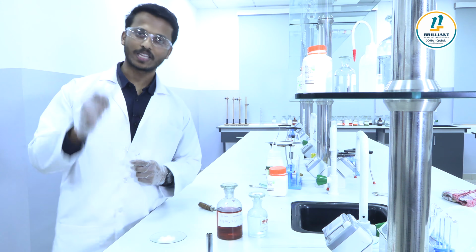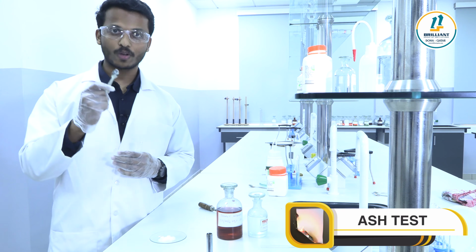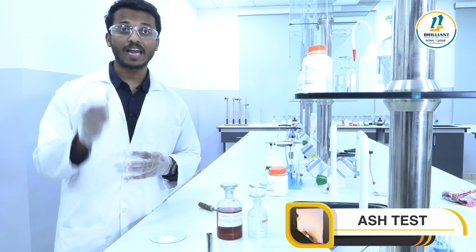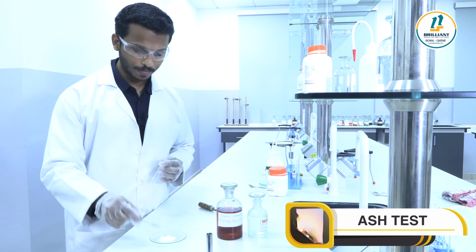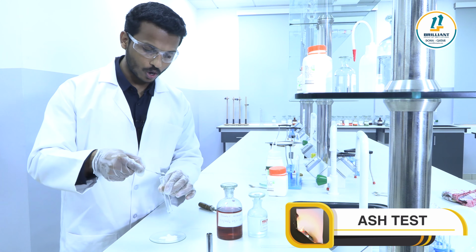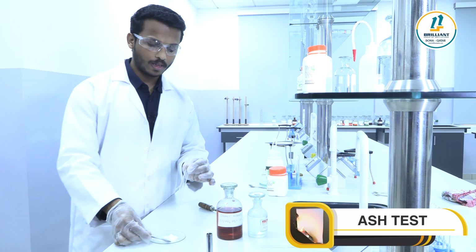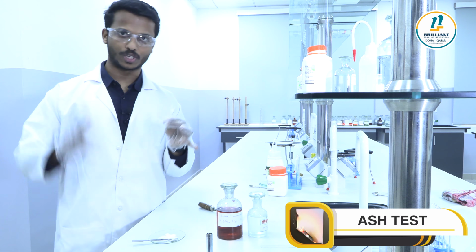Let's do another preliminary test, that is the ash test. We already observed the flame test. Now we are going for the ash test, mainly to confirm the presence of aluminium and zinc. Carefully listen, it's a very interesting procedure. Let me take a pinch of salt into the test tube. You can do this ash test either with the given salt or a salt solution.